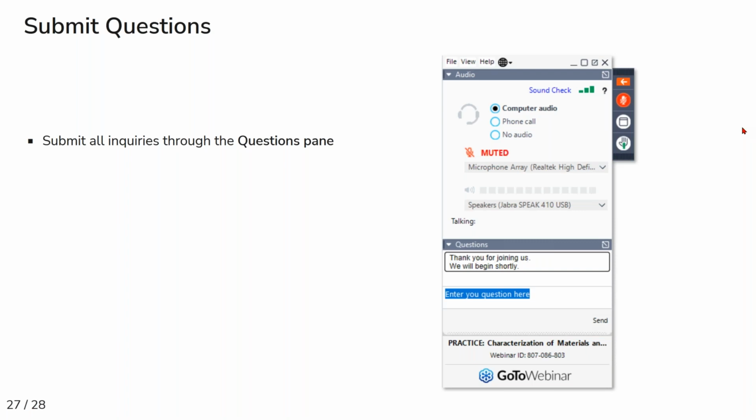We thought about labeling CDH23 too, and that might also be a thing to do. But still, I think the main problem is that the tip link still breaks so much during data preparation. So I think for the moment, the most important would be to find a sample preparation that is more gentle to the tip link.